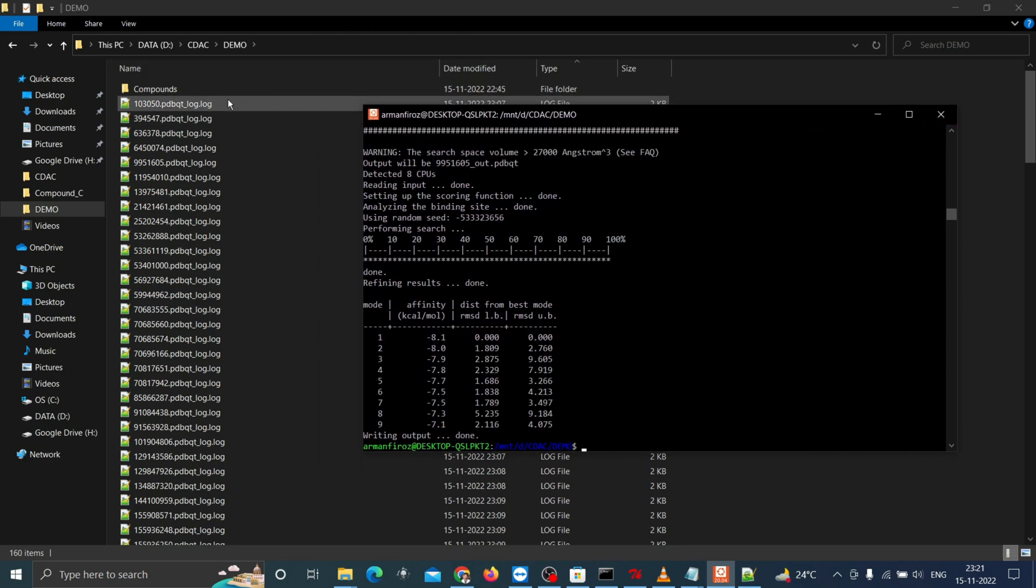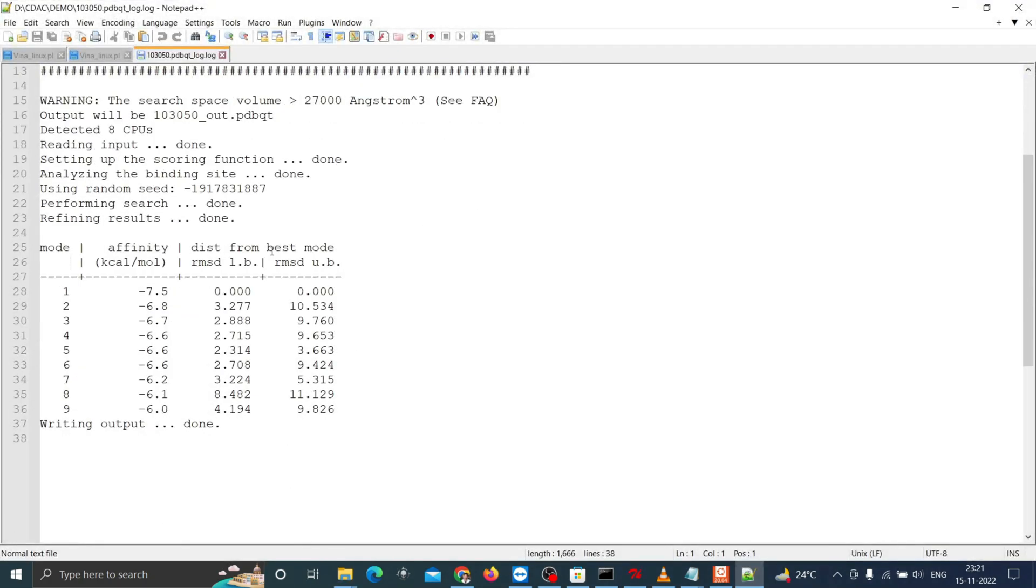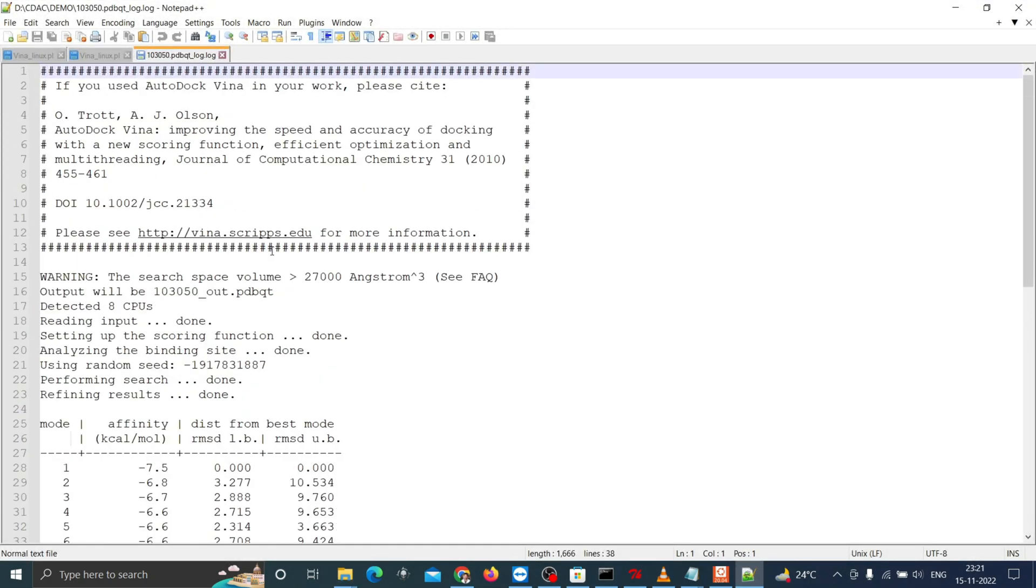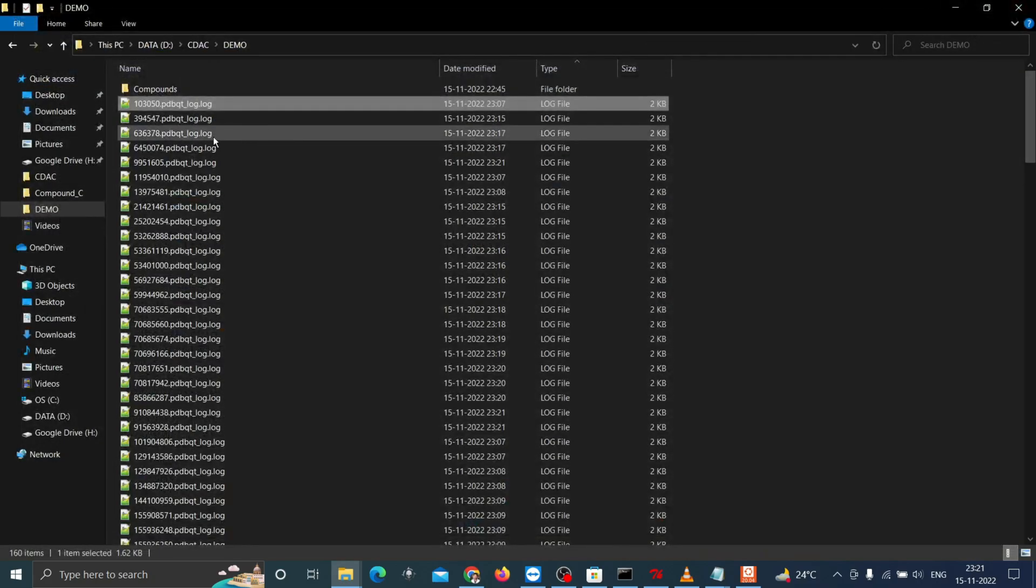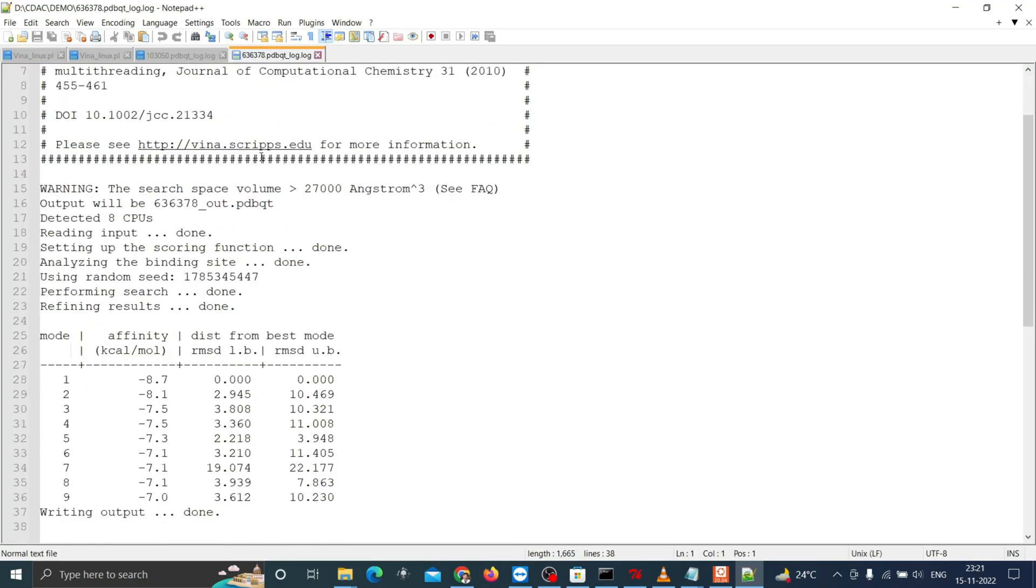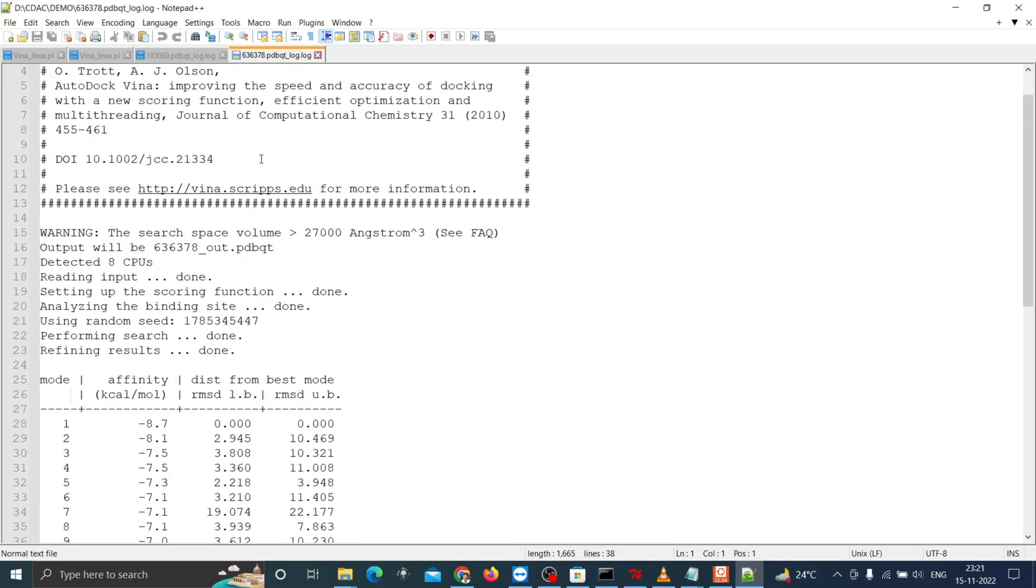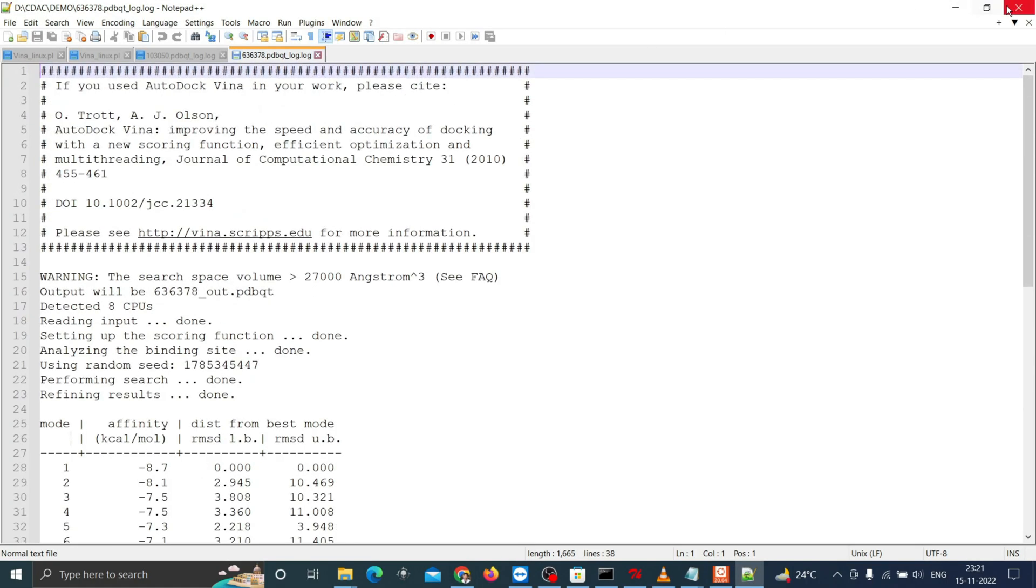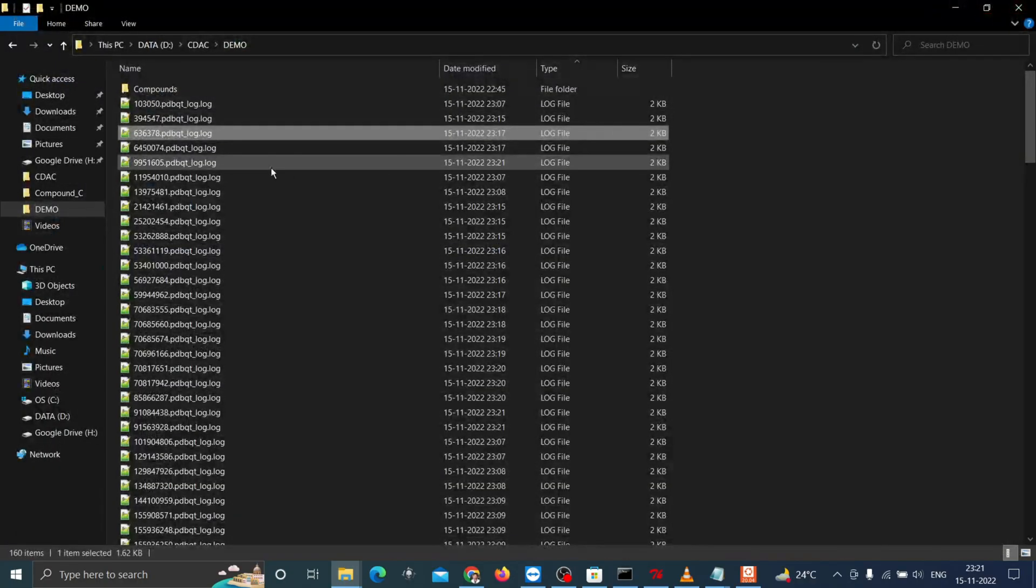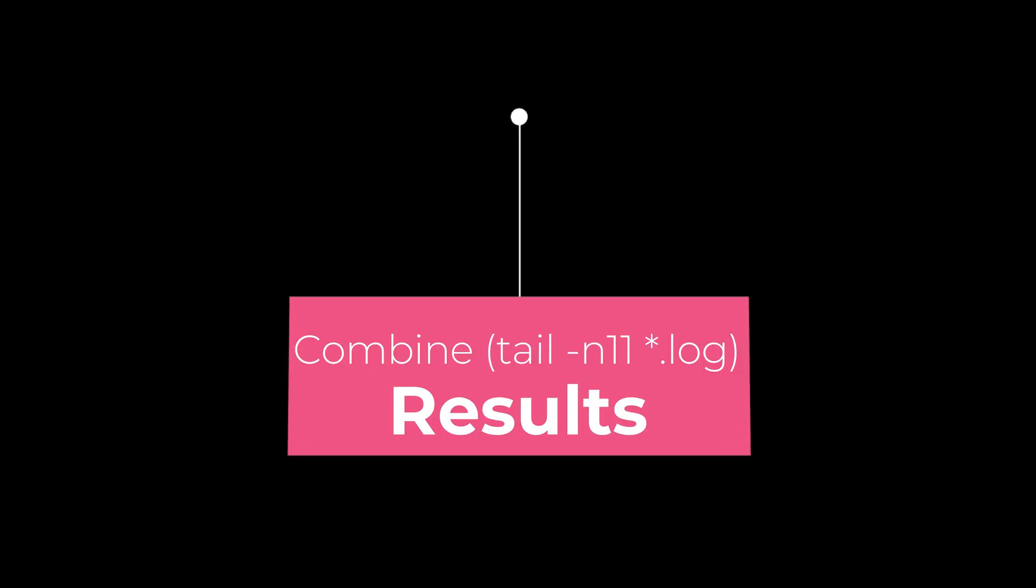Here you can see log files of individual docked complexes with the top 9 possible docking modes. As we have results in individual files, we need to combine all these log files for comparing the compound with higher docking affinity. Let's see how we can combine all these results.